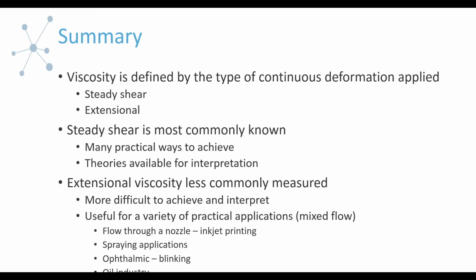Although, as I mentioned, our testing with our extensional chip is not a pure extension, but rather a mixed flow, that's generally what you're going to see in practice too. You're generally not going to eliminate the no-slip boundary conditions, so you're always going to have, in many situations, this mixed extension and steady shear flow.